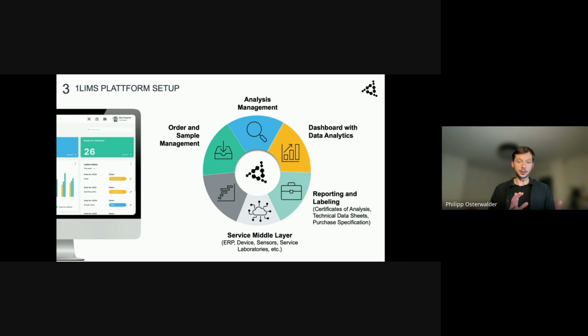It's not always necessary. Mostly it comes after a while of using, or if the lab has scaled or grown to multiple lab technicians and a heterogeneous zoo of different devices.